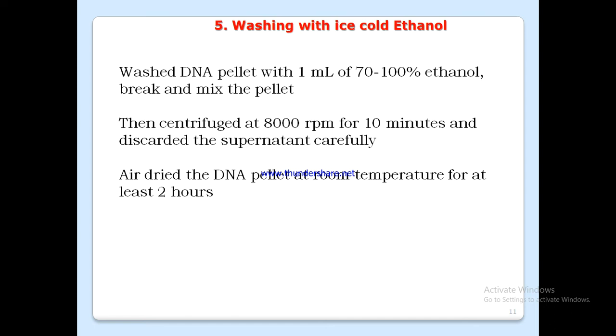Washing with ice-cold ethanol. Wash the DNA pellet with 1 ml of 70 to 100% ethanol. Break and mix the pellet, then centrifuge at 8000 revolutions per minute for 10 minutes and discard the supernatant carefully. Air dry the DNA pellet at room temperature for at least 2 hours.